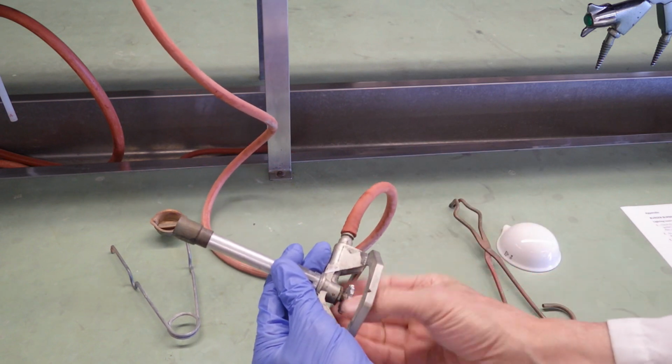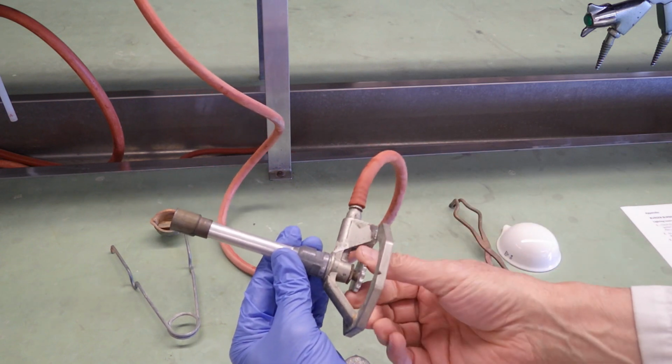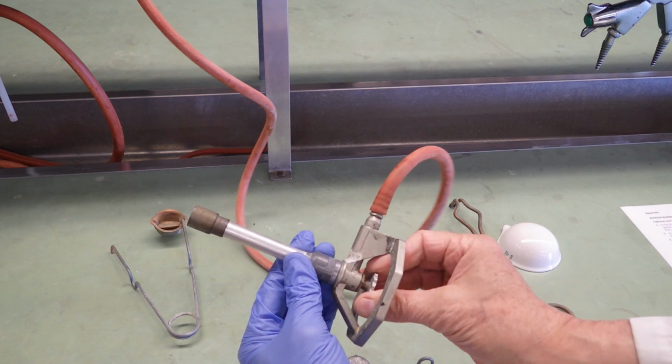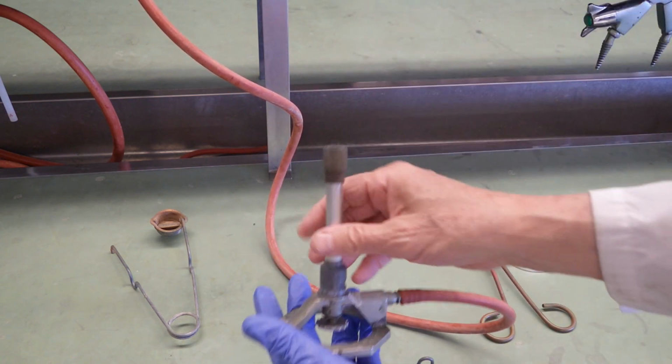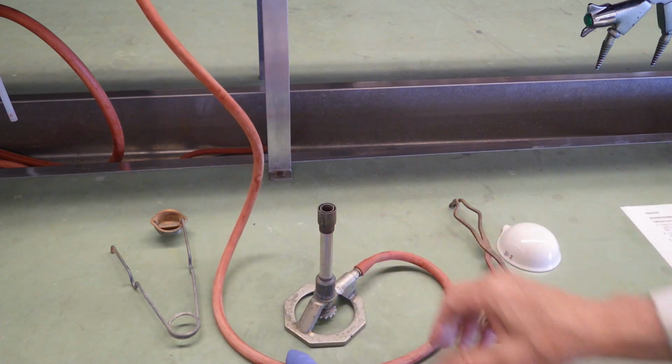If you can't hear any gas, it's not going to light, so open the valve at the bottom to allow more gas in, and then listen again. Okay, so if you listen and now you hear it, it should light easily.